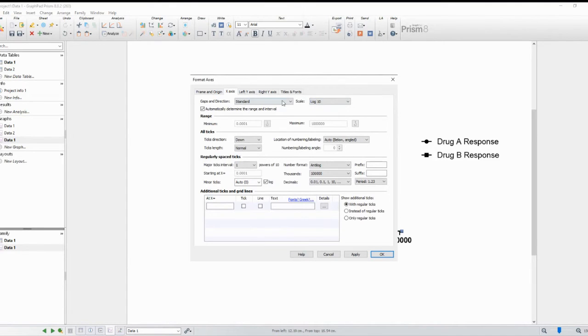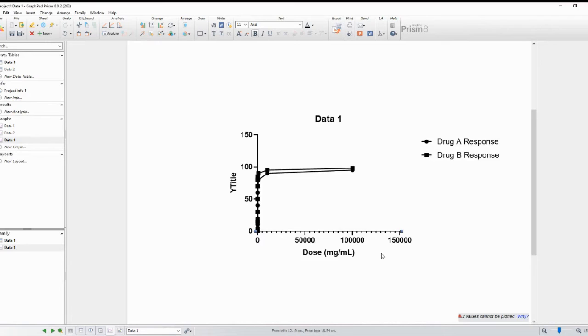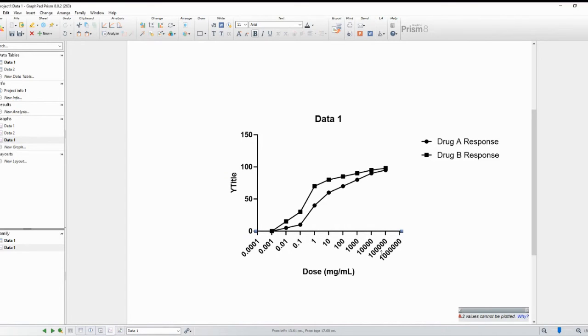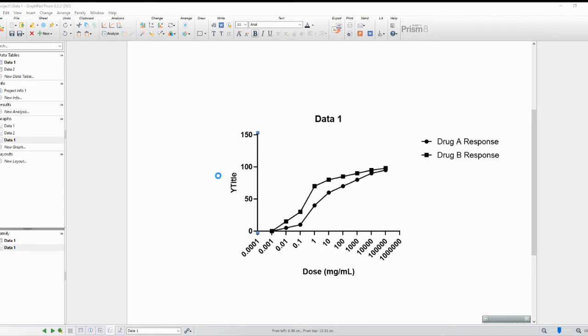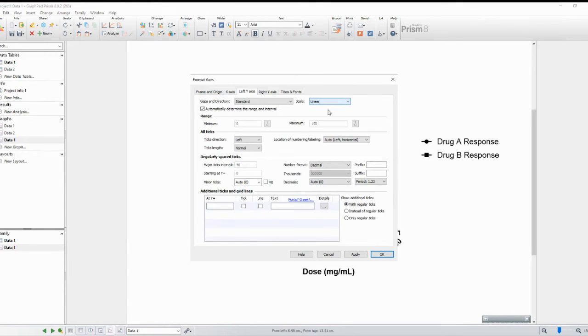Once the graph is generated, double-click on the X-axis and make the scale logarithmic. Additionally, you can double-click on the Y-axis to make 100 the maximum value. You can then double-click on the graph and make the different drugs have different colors.